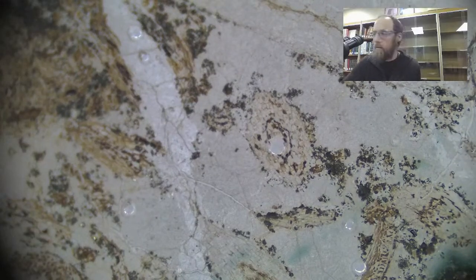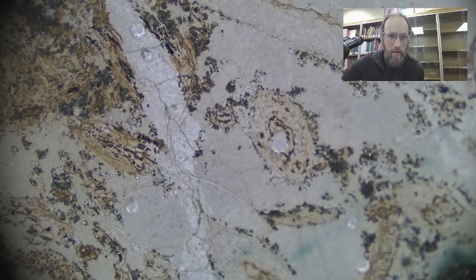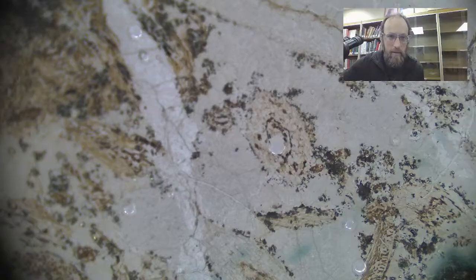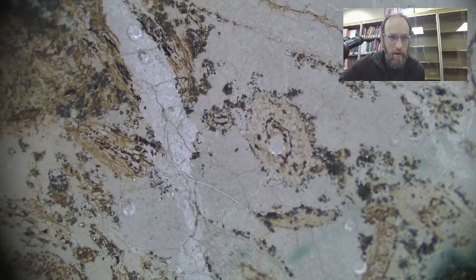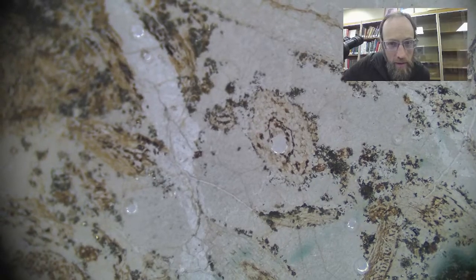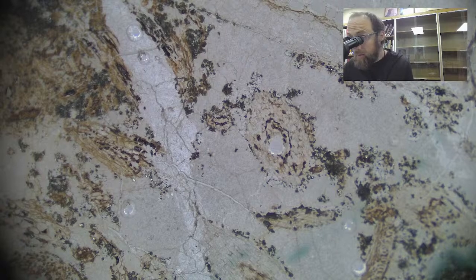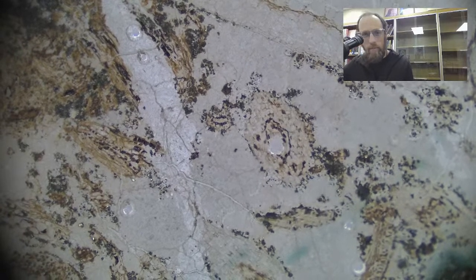And then what do we have here? This is as far as I can zoom in, so obviously that's going to be very small. That is less than 1 millimeter across. I'm not going to make too big of a deal out of it, so I don't really know what that is though. Sometimes it's easier if I look in here.